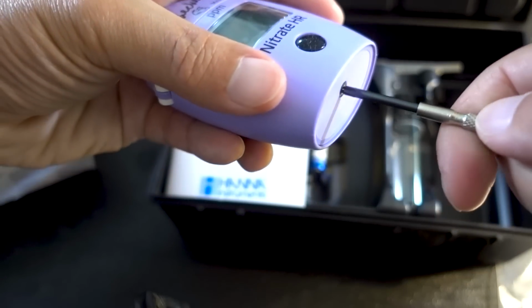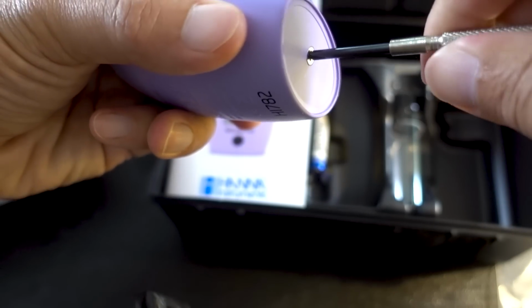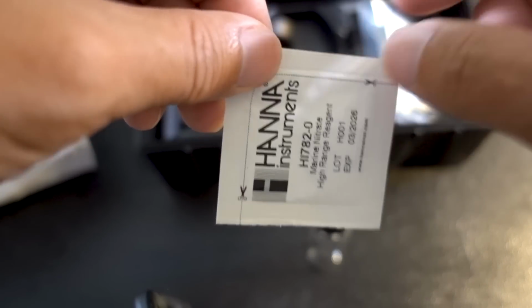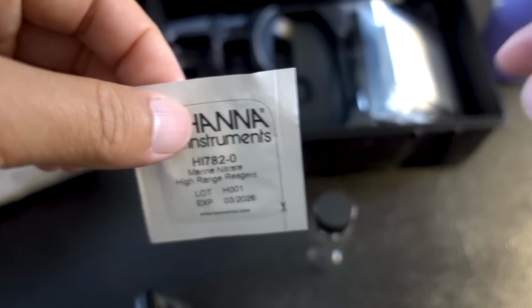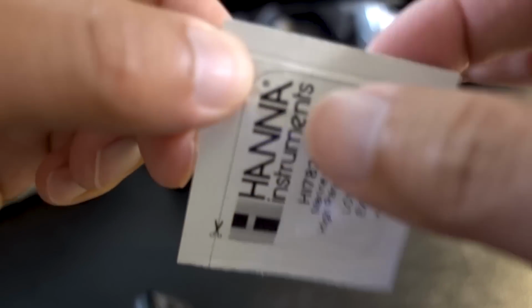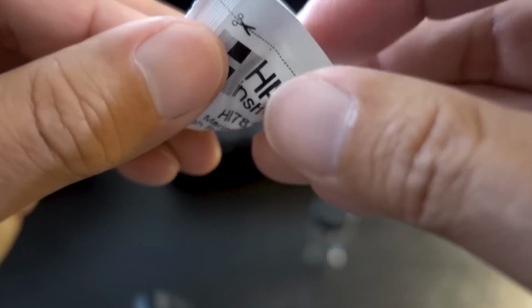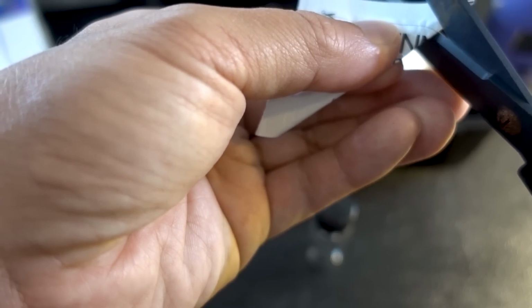I'm not a huge fan of the screw in the checker, because it's one of those smaller screws where you need a specialty screwdriver. It's no secret that I'm not a big fan of these square pack reagents, but I do appreciate the fact that this time around, instead of one long chain of those, they actually cut it for us. Taking hints from my Reef Sensei Telegram as well as Kevin at Hanna Instruments, I'll flick a couple times. I like to fold it in half, and this bit came from Kevin, and I'll cut it at the dotted line.